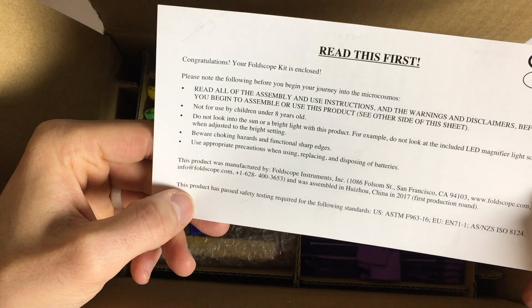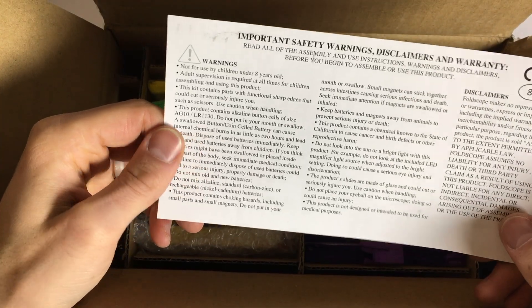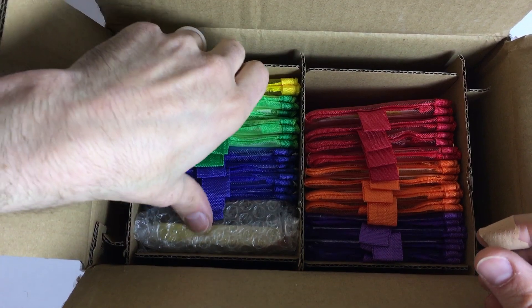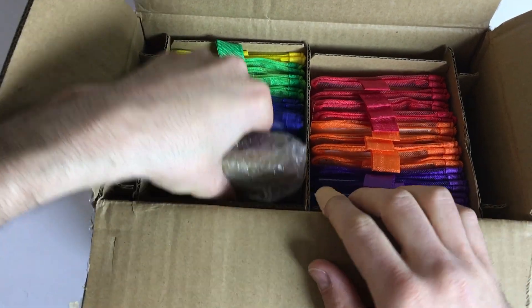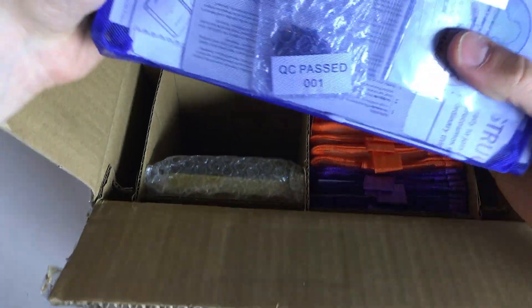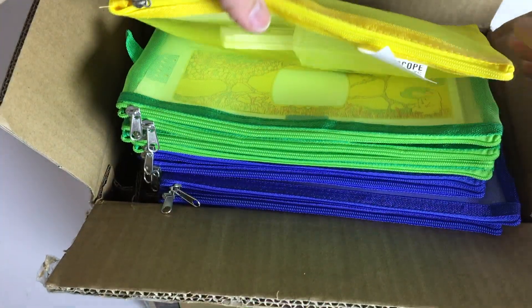Foldscope instruments. Actually, I think it was about three years ago that I saw the maker of it giving a TED talk about this and I thought that's really cool. And I think he said it would cost like 50 cents to make. Then as time progressed it got more and more expensive. But look at the coloring — that's nice.